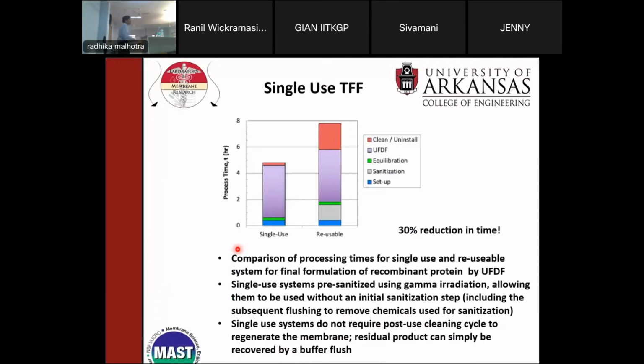So here's an interesting figure. There is so much interest in single-use devices. This is a reusable device, and this is the amount of time required. The blue time here, the gray time is what you need for sanitization. This is for equilibration. Purple is actually running UFDF, and then the red one is clean, uninstall, and get ready to run again.